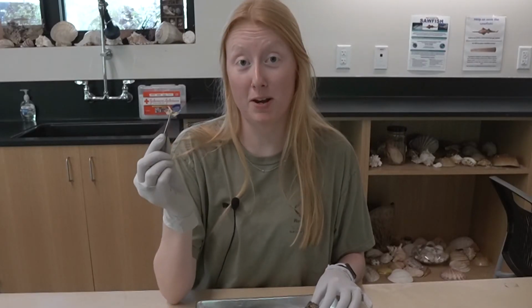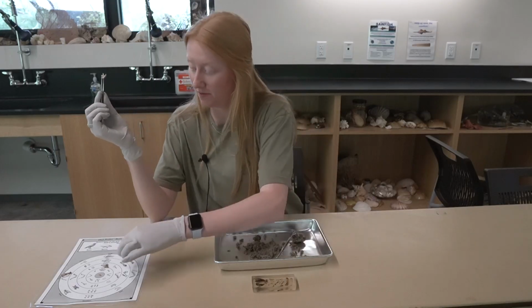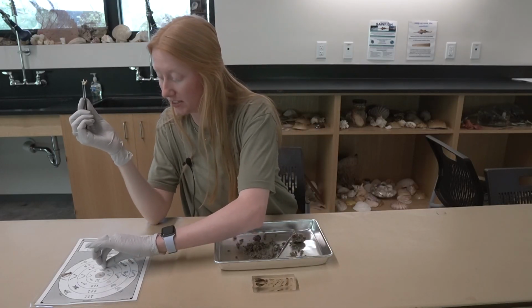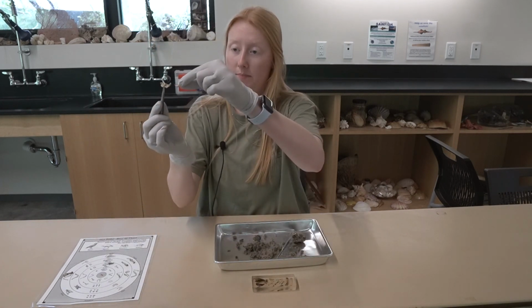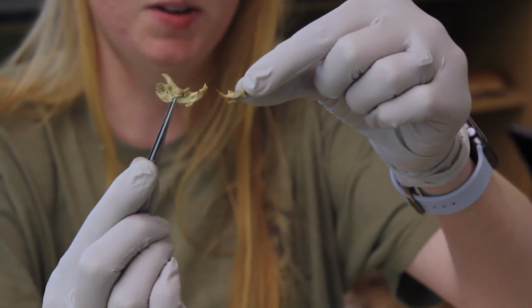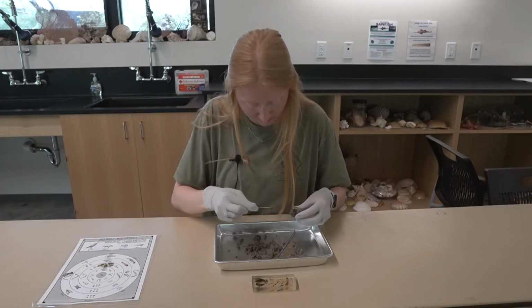An even bigger bottom jaw from an even bigger rat or mouse. So if you want to compare the sizes of the things this bird can eat and why it's such a good predator, that would be a good time. So, big rat, little rat.